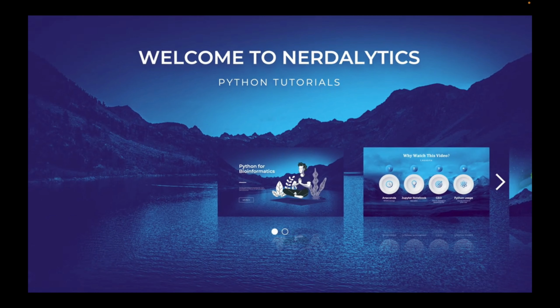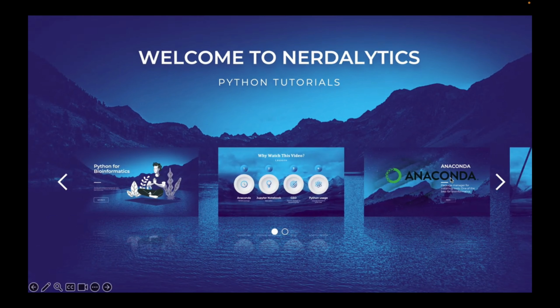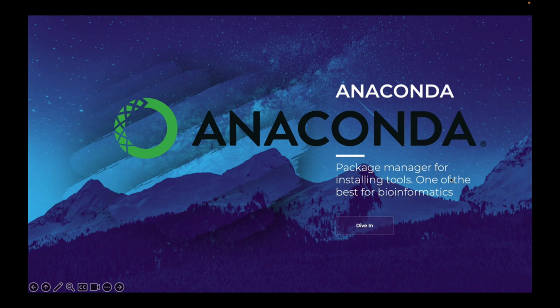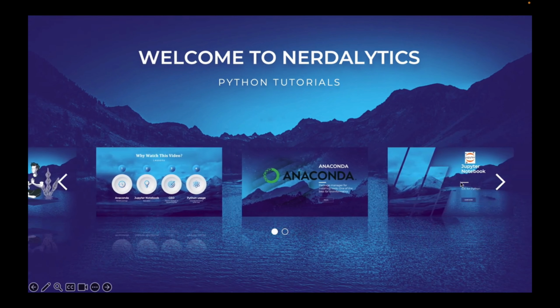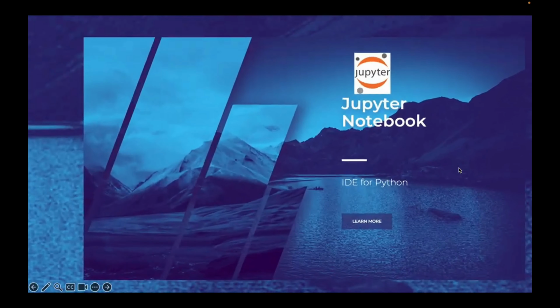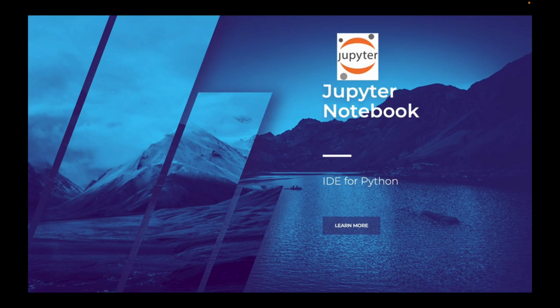So the first thing that we require is the Anaconda package, and this is the package manager for installing different kinds of tools, not only Python but also R packages as well. And this is one of the best package managers for bioinformatics. Okay, the next thing that we are going to learn is how to launch Jupyter Notebook from the conda environment, which is an IDE for Python.